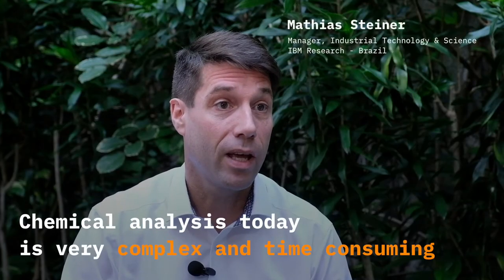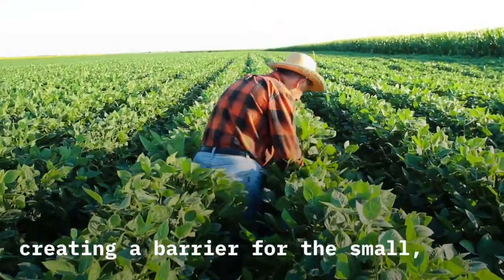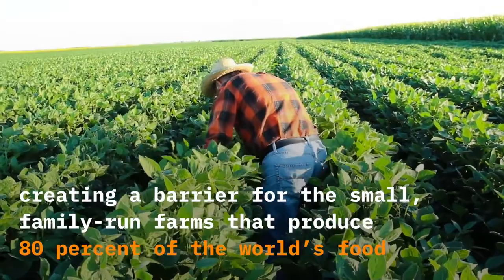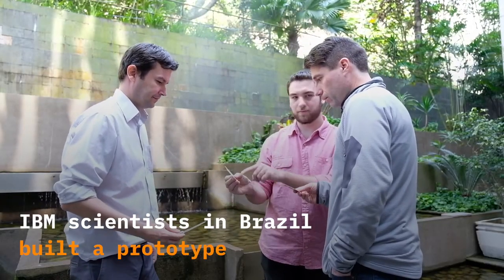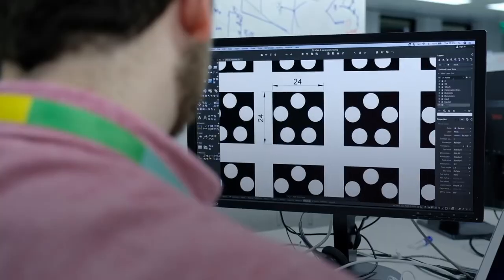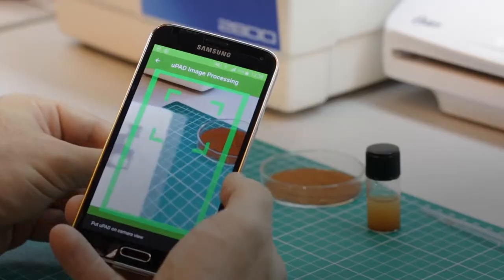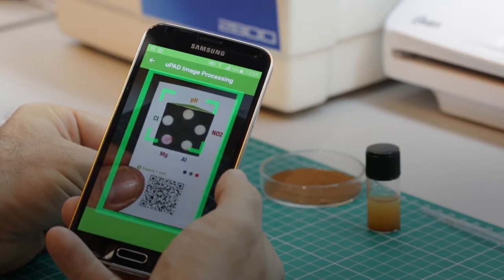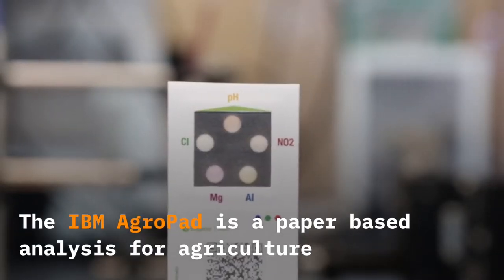Chemical analysis today is very complex and time-consuming. The IBM Agropad is a paper-based analysis for agriculture.